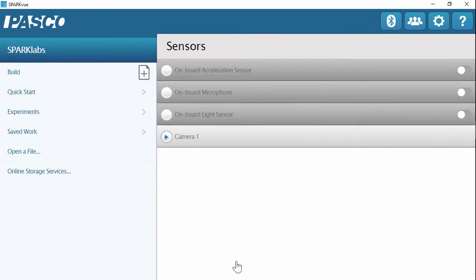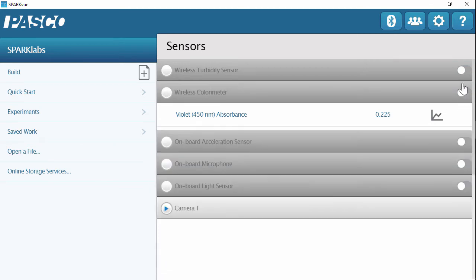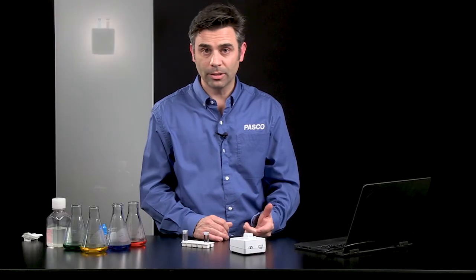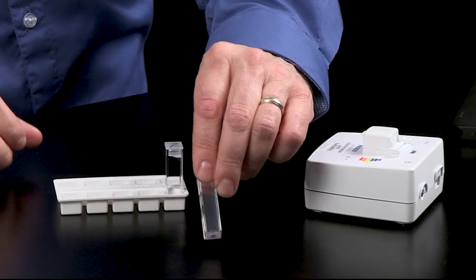I'm going to hit done. And now on my home screen, I want to make sure I'm looking at the turbidity sensor measurements. I'm going to close the colorimeter. Make sure turbidity is open. And now I'm getting 99.5 NTU, about 100 that I standardized with. So that's great. My calibration took. Now I want to measure my turbidity of the unknown.